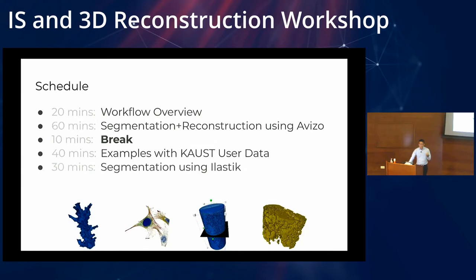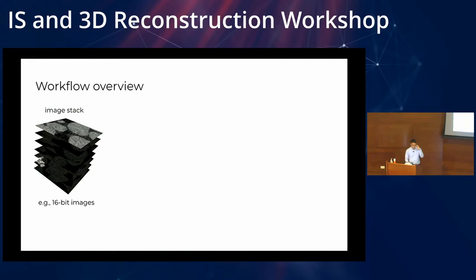Then we'll get into Ilastik, which is an alternative software for doing segmentation. Finally, James will talk about how to run Ilastik on IBEX. This is for cases where you have data sets that are too big and would take days or weeks to run the segmentation on your workstations. So this is our schedule for today, and let's go ahead with the overview.